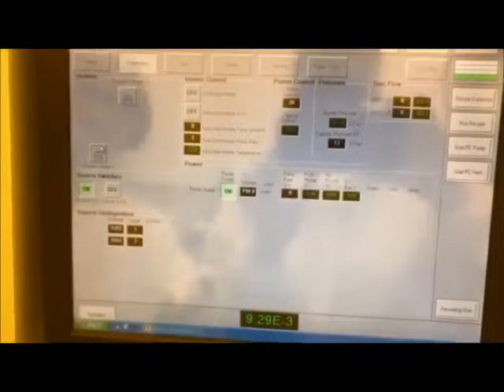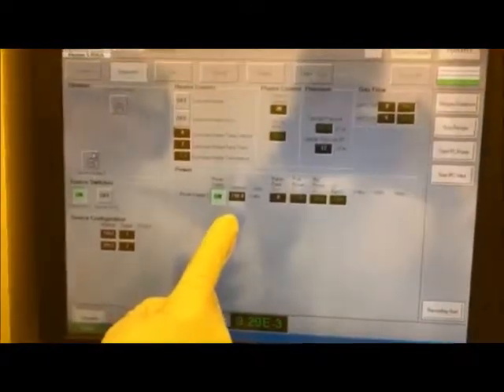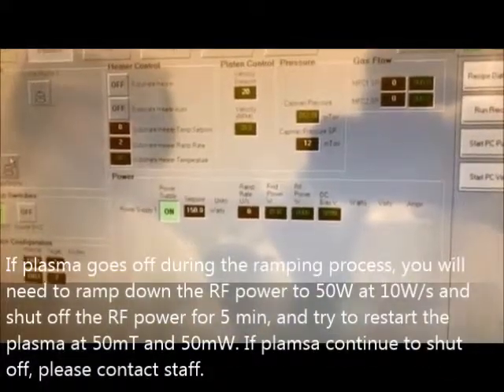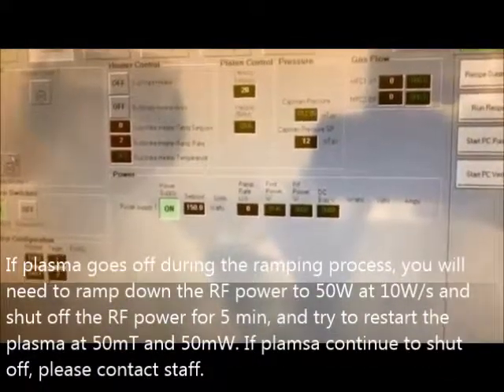However, there are some situations, it depends on the chamber. Even when you open the shutter, suddenly when you increase the power or reduce the pressure, the plasma will go off. If that's the case, even if you try opening the shutter, you cannot get the plasma turned on. What you have to do is ramp down the power all the way back to 50.